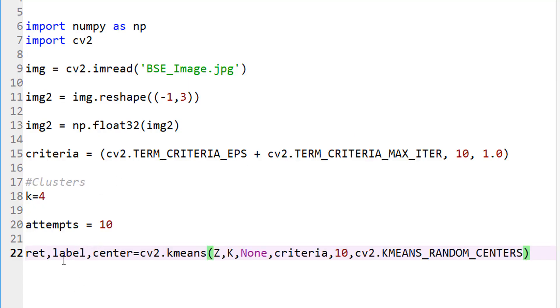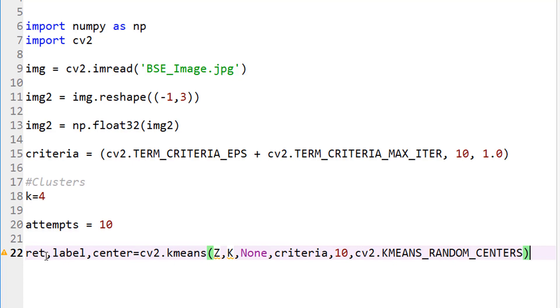So it's going to return our output. This algorithm outputs three things. One is compactness. I'm just returning it. Compactness is the sum of squared distance from each point to their corresponding centers. It tells you what the compactness is for that cluster. Labels, as you know, these are the labels. And then center is the center of each cluster.